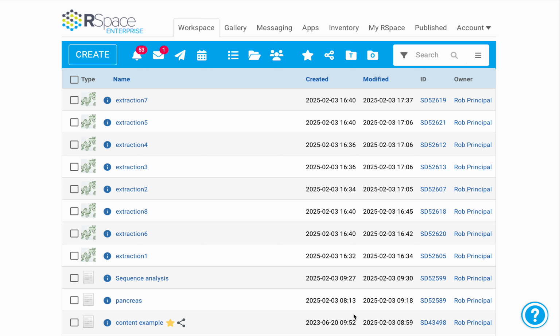Today I'm going to show you how to use the new Export to CSV feature inside RSpace. Now this feature is ideal for taking a cohort of data in the form of a set of identical or similar or even different RSpace documents, and then looking at the data in a field by field manner to compare different fields or to look for trends or anomalies within a series of documents, which in this case might represent perhaps a sequence of 8 different experiments.